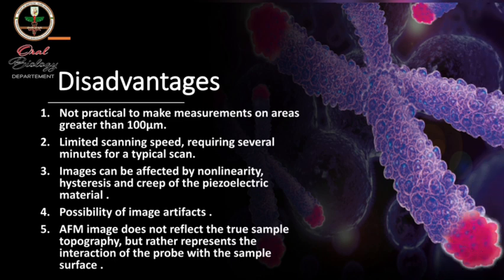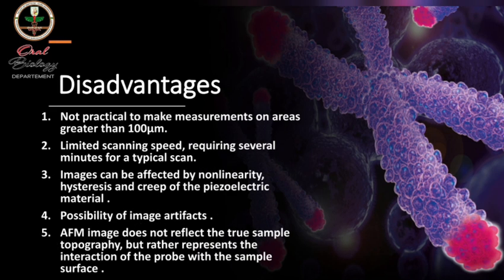Now, moving to the disadvantages of this technique, the first one is that it's not practical to make measurements on areas greater than 100 micrometers. Also, it has limited scanning speed, requiring several minutes for a typical scan. Also, the images can be affected by the nonlinearity, hysteresis, and creep of the piezoelectric materials, as well as the possibility of image artifacts that can be produced after that.